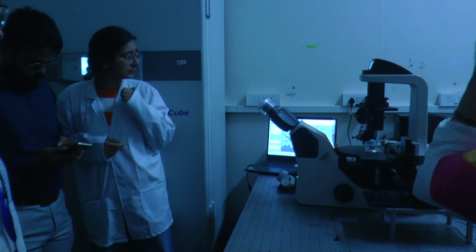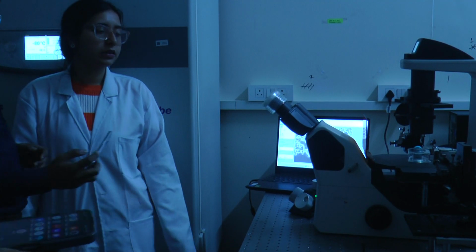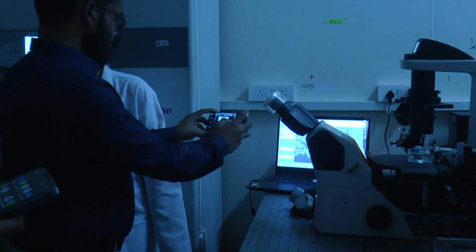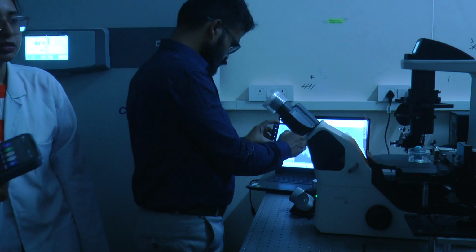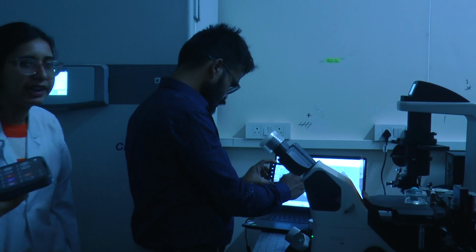What is the size range of GPMVs? I think the max size that I get is around 20 microns, and 5 to 20 microns, like that.